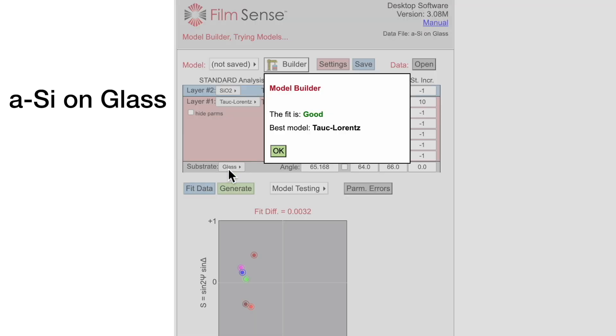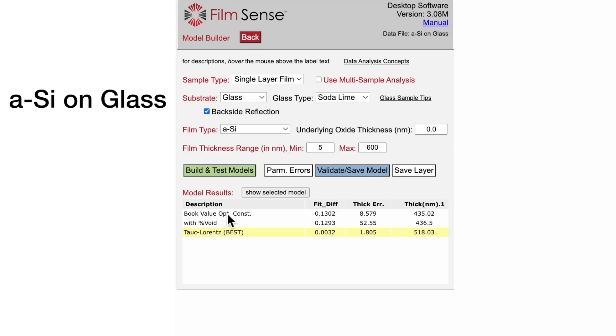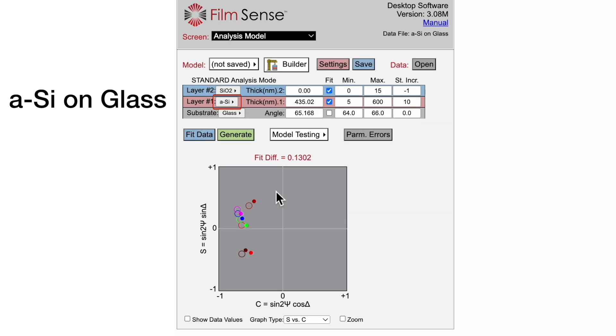Once again, the book value optical constants do not fit the data very well, but note that Model Builder automatically adds a native oxide layer on top of the amorphous silicon film.